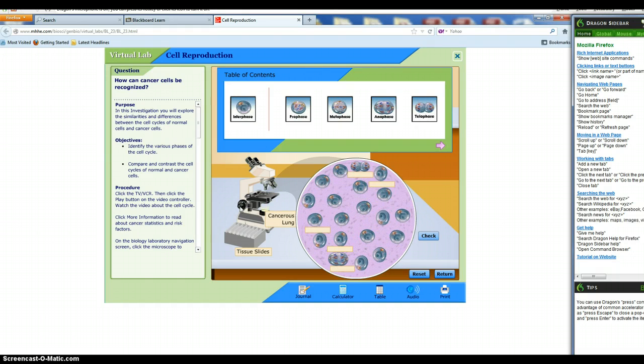Okay, so the idea here, just to make sure you know what these phases look like, is to label these different phases. So to label the phase, this one's going to be interphase because we're not getting division. You'll notice there's quite a few interphase. In fact, the non-dividing cells make up the bulk of all the cells. And in every microscope slide, there's a total of 20 cells. That just makes your calculations easier so you don't have to count.